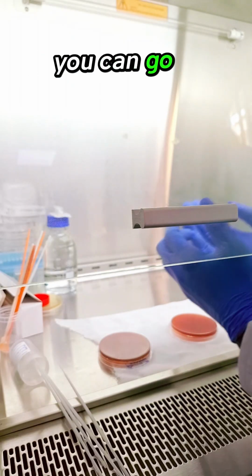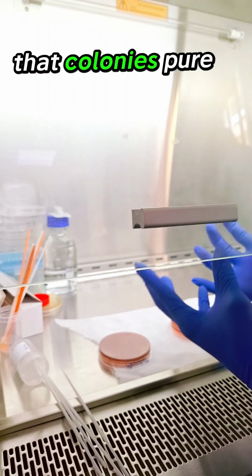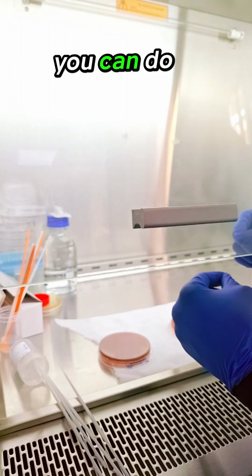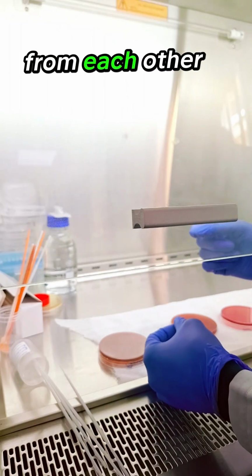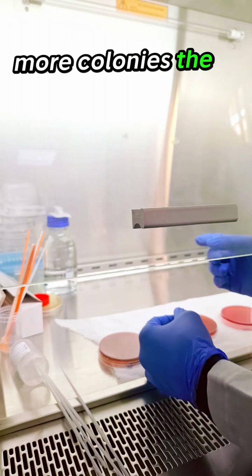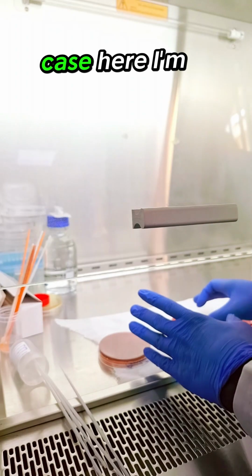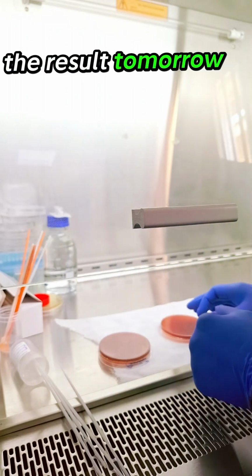And of course, you can go further. If you cannot obtain pure colonies exactly, you can do other subculturing, picking the colonies that have separated from each other and inoculating them to another place so that at least you can get more colonies the way you want. For my case here, I'm going to incubate this plate and wait for the result tomorrow.